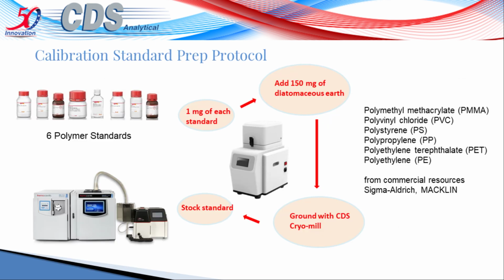One difficulty which arises with quantification is the challenge of weighing microgram quantities of often an insoluble polymer to create a standard curve. This is overcome by adding the polymer to a solid matrix, such as diatomaceous earth. In this experiment, we're quantifying microplastics in shellfish, and we use 6 pure polymer standards.